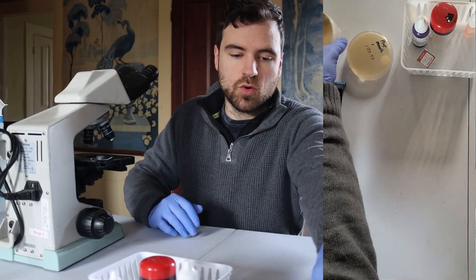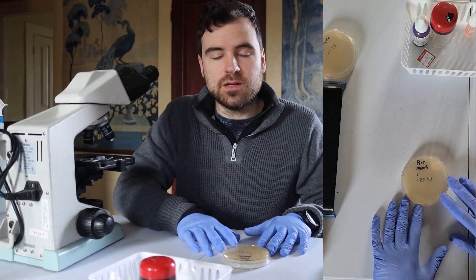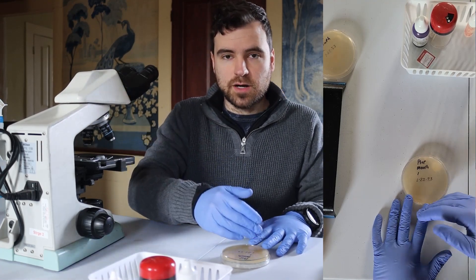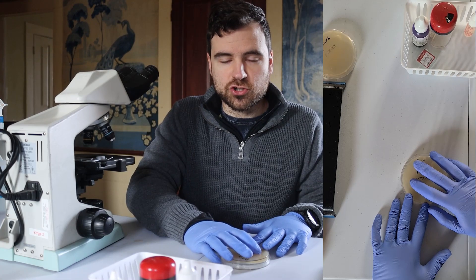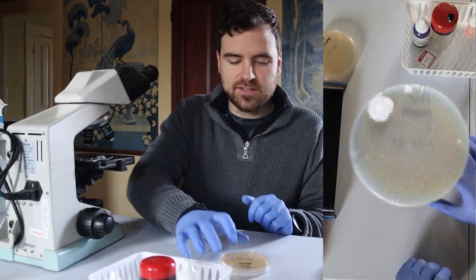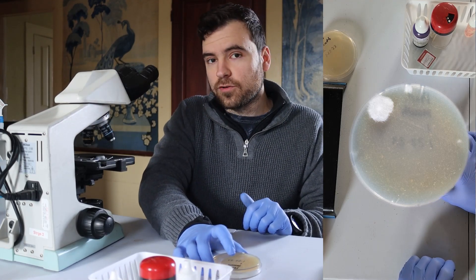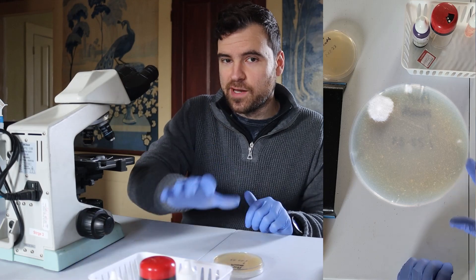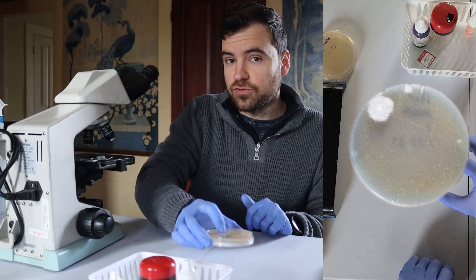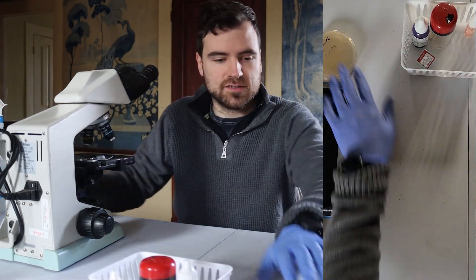I'm gonna move that one aside and go over the next one. Now we have P.O.P. Ni mouth — this is the plate where I poured out the P.O.P. Ni culture and then took a swab from my mouth. As you can see, this is not our P.O.P. Ni culture. However, there's a test we can do to make sure if we're uncertain. I'm pretty sure it's not, but we're gonna look at this in a little bit, so we'll set that aside.